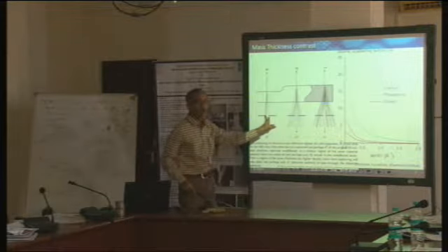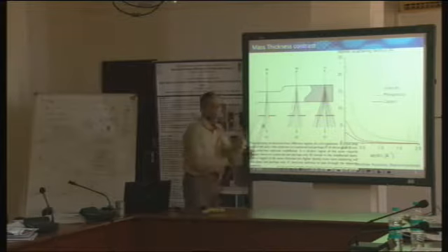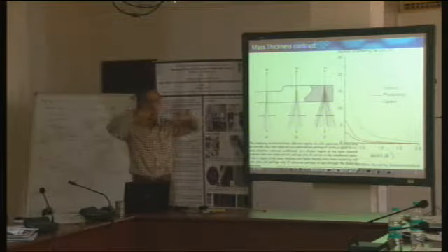Now when I put an aperture like this, I use only the rays which pass through it. The objective aperture is of a definite thickness. Aperture means there will be, let's assume, two metal plates.